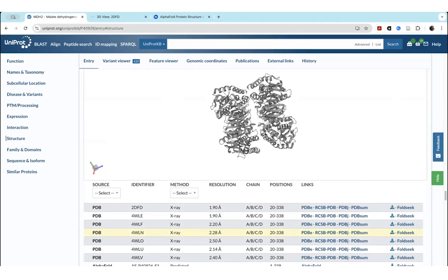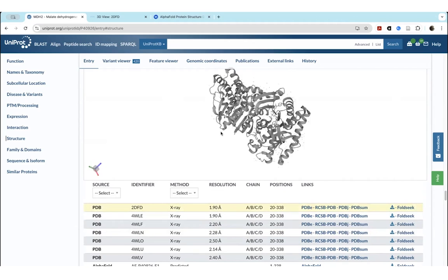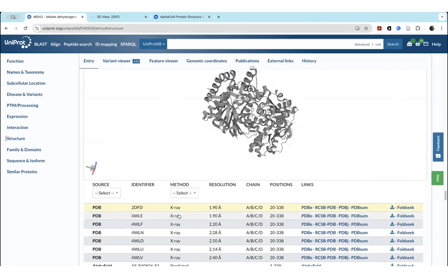And so don't get tripped up on that, but if you don't want to be dealing with multiple subunits or something, you can probably choose a version that's going to be easier to work with. But you don't know what else is in the files, and maybe there are some other things about them that are different. And so you can explore the PDB entries to find out more. So these are just things that you might encounter when using the PDB or when using UniProt and all these tools. But hopefully things are more simple for the proteins that you want to look at.